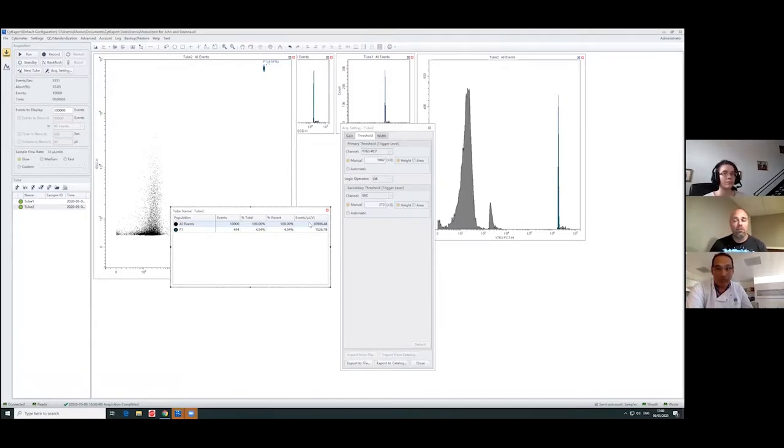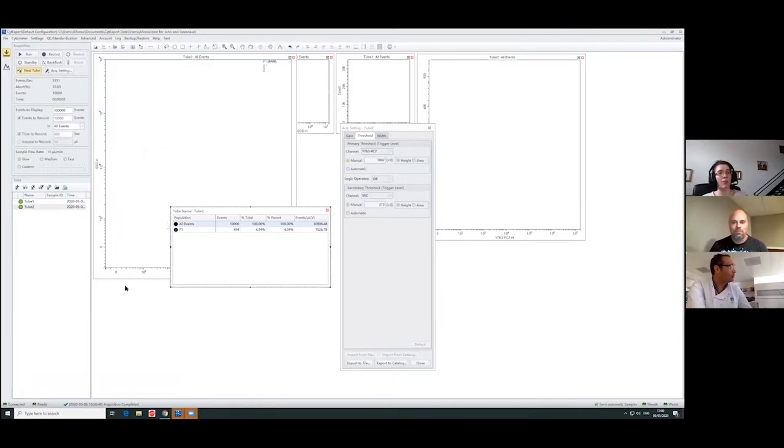Because you can also cut off the beginning portions where you tend to get these boosts, peaks and valleys. If you're cutting off the beginning portions, should you add a wait time to your protocol before you hit record? No, because the minute and a half is good enough, but who knows? You could get that in the middle, where you get a weird turn of the peristaltic pump. That's why Alfonso was saying time becomes a huge parameter in these things, which we may have to touch base on more in the next section, because setting up the machine is not as quick and easy as one would say, especially when you're trying to walk someone through it.